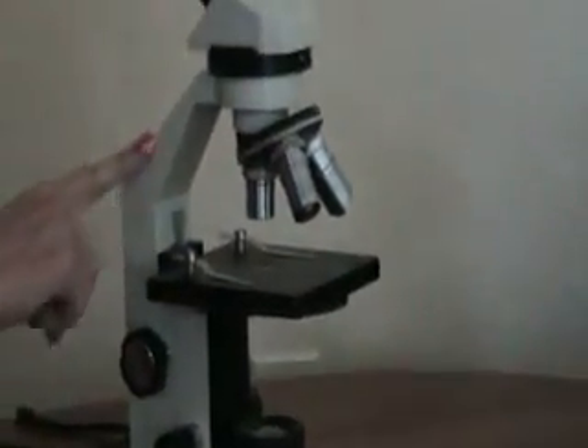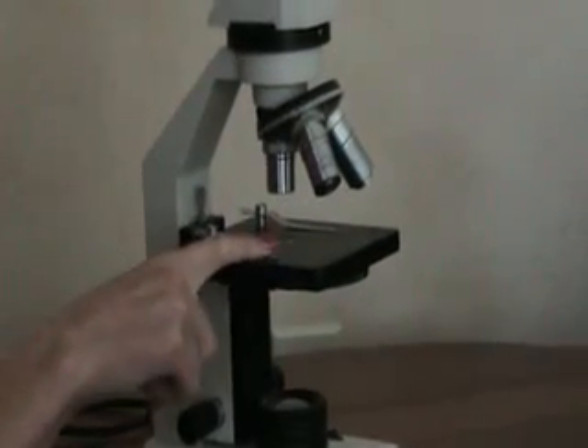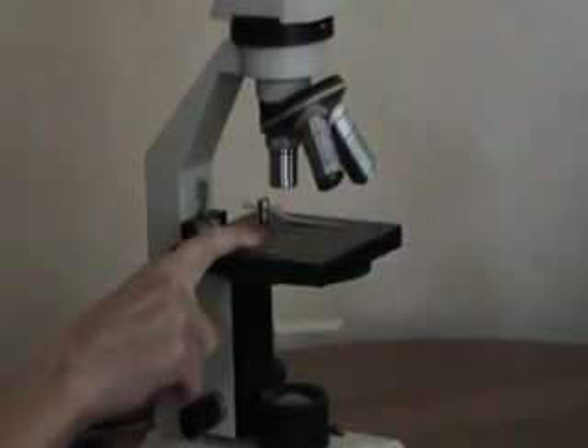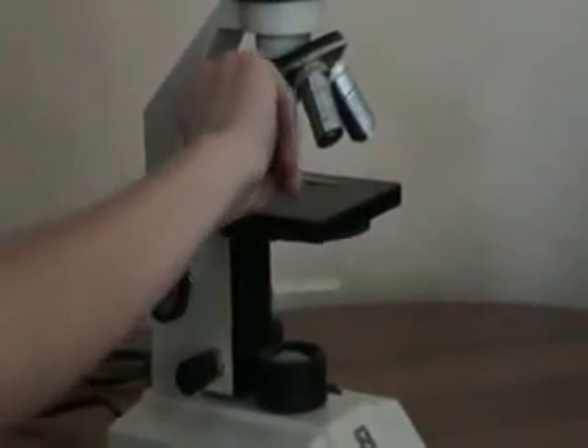Going to the back, this is the arm of the microscope. Going forward, we have the stage clips, which hold your slide on. You put the slide over the light source and clip them down with the clips.